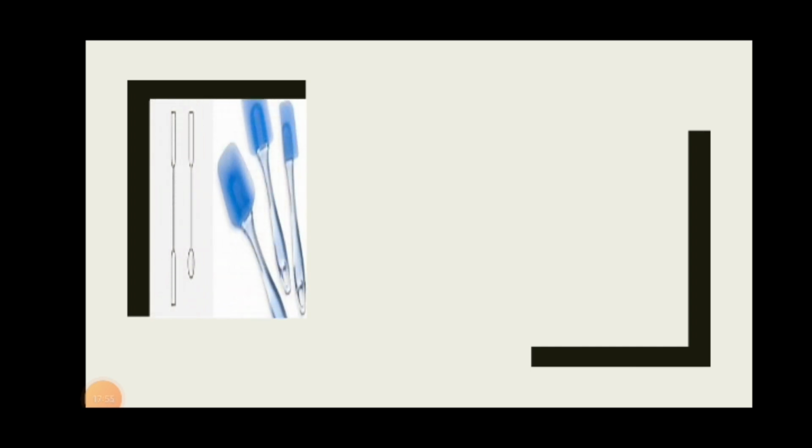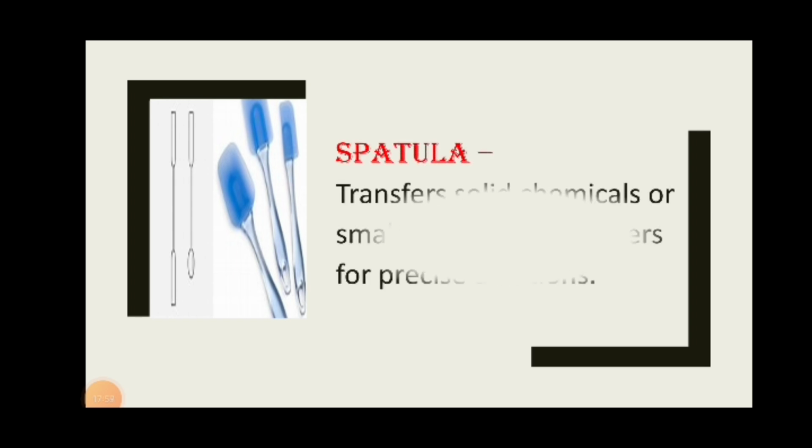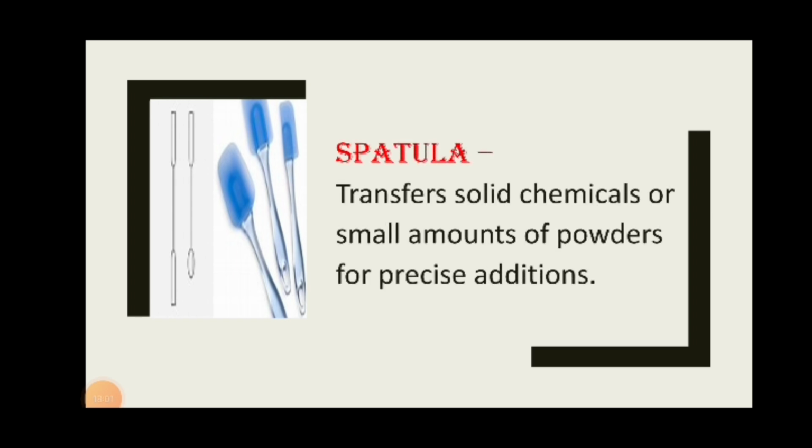And the next one is, yes, this is spatula. There are many figures of spatula. Meron yung, say for example, ng recyclable spoon could be used as a spatula. Plastic, no, spoon is a spatula. If you want to recycle that after a dinner or whatever, gumamit kayo ng plastic spoon, it could serve as a spatula. Meron namang stainless na spatula.